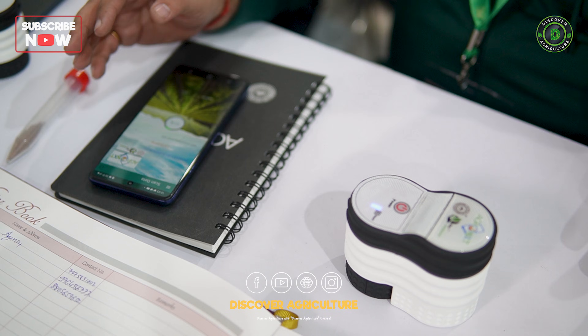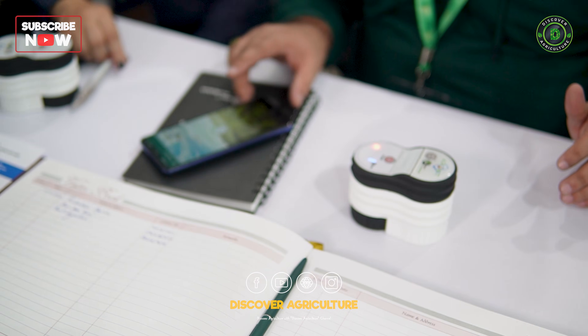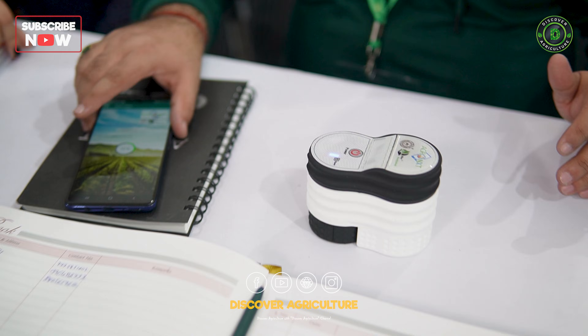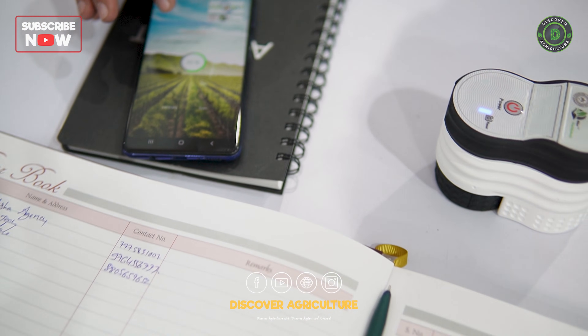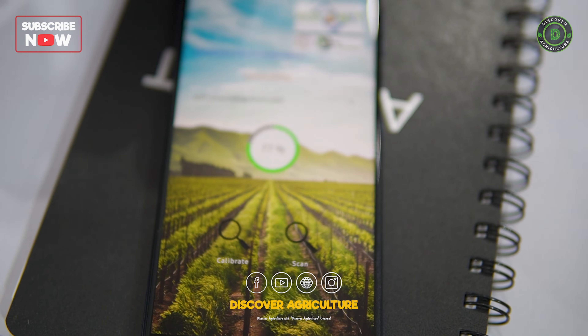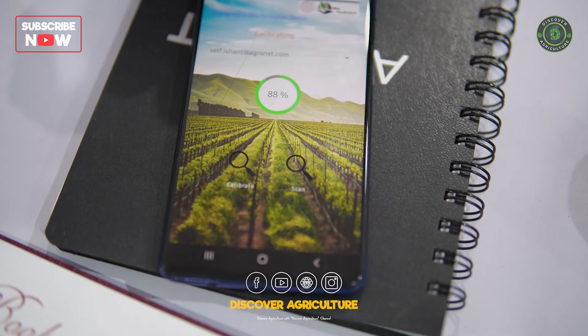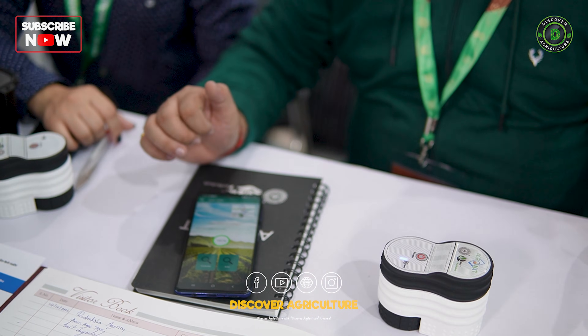As we tap on the calibrate tab, the calibration process will take place and you will find the progress of the calibration on screen. Once calibration is done at 100 percent, we can proceed towards scanning the soil sample.